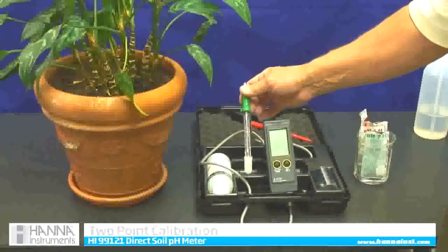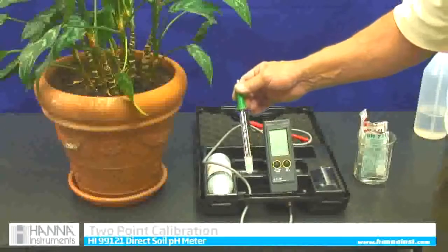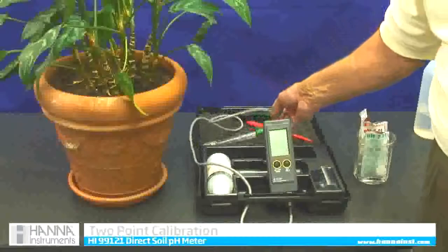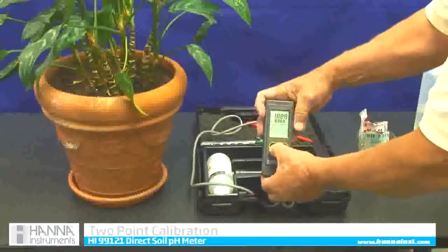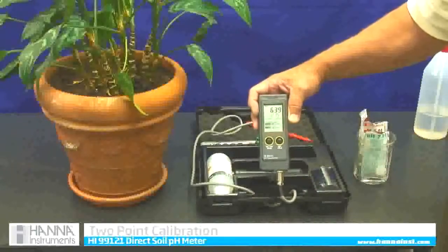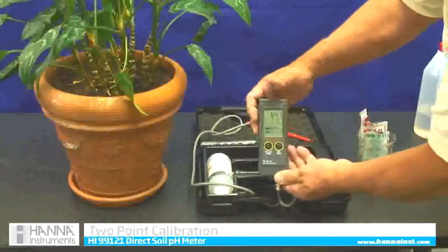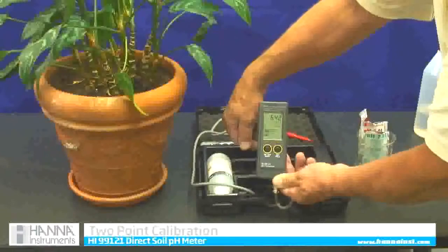The first thing we have to do before we use it is calibrate it, and this is self-calibrating. We have to get it into calibration mode and then follow what the screen says. To get into calibration mode, I am going to push the on/off button once to get it on, then depress that same on/off button until C-A-L pops up.